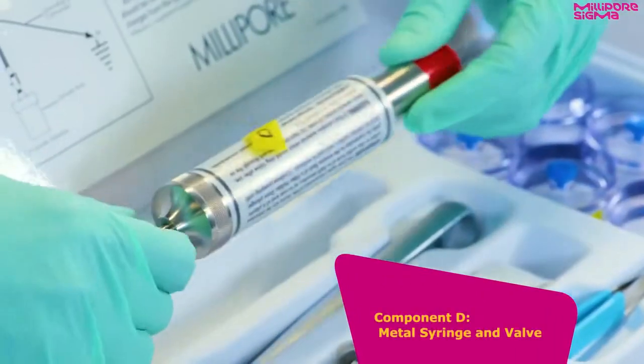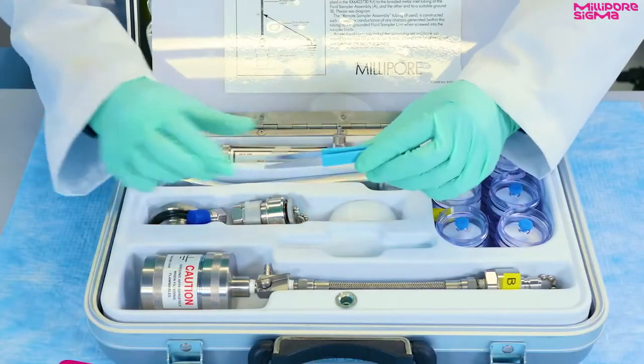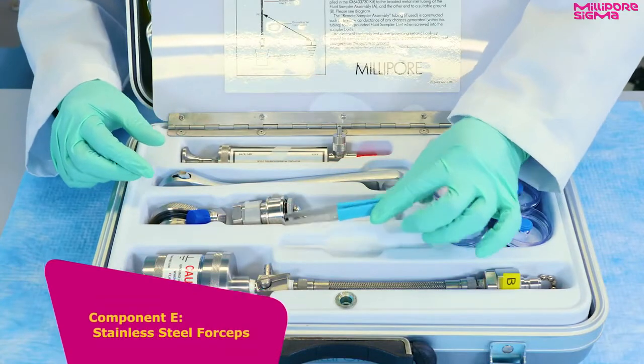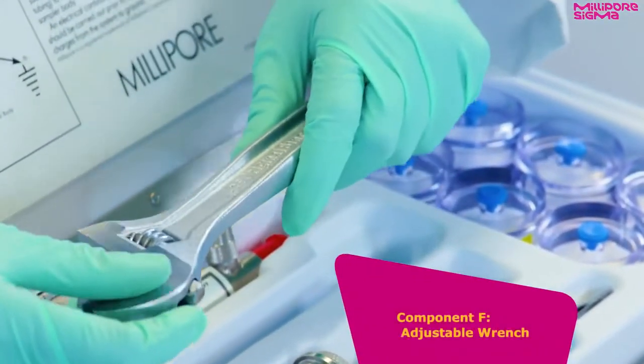Component D is the metal syringe and valve. Component E is the stainless steel forceps. Component F is the adjustable wrench.